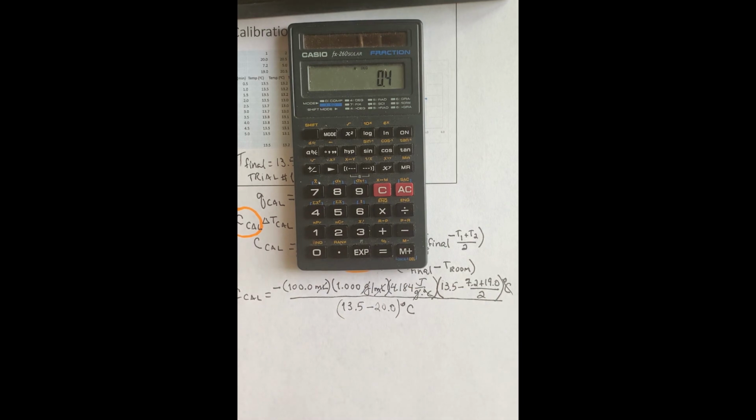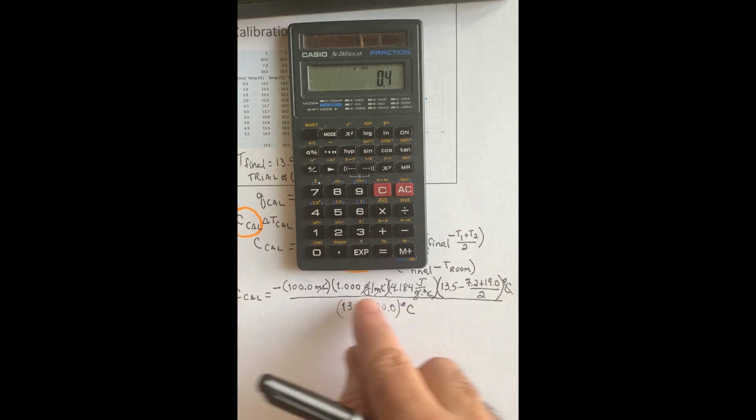And it gives me 0.4. Again, it's only one sig fig, but I'm going to try to keep everything to two sig figs here, and you'll see why later on. Okay, let's continue this operation here.